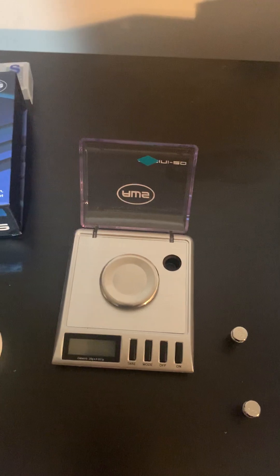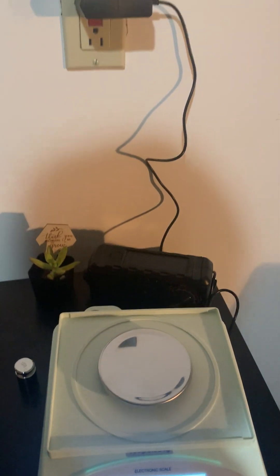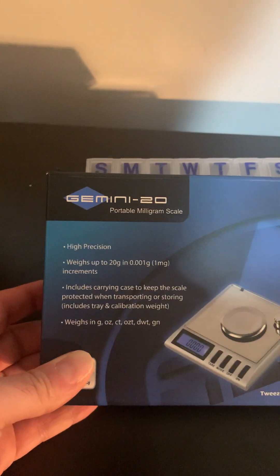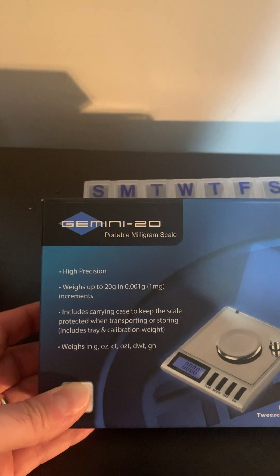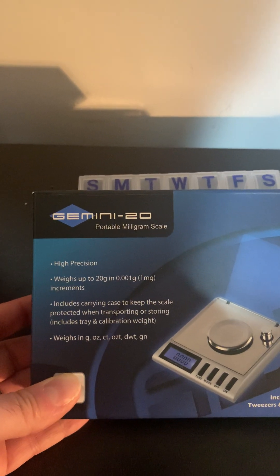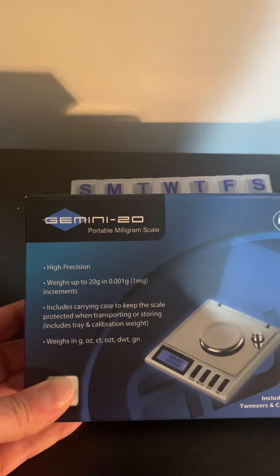One difference is that the Gemini 20 is battery-powered, while the Onilab is plug-in, which I thought would be great. The Gemini 20 — I'll leave a link with the product info for both in the video — is high-precision, weighing up to 20 grams down to 0.001 grams, which is one milligram. The Onilab weighs from 100 grams down to 0.001 grams.